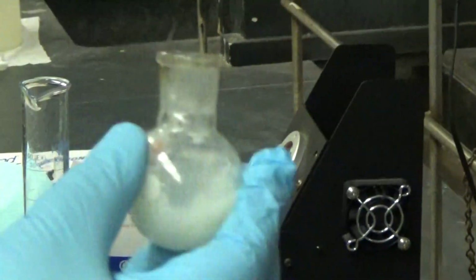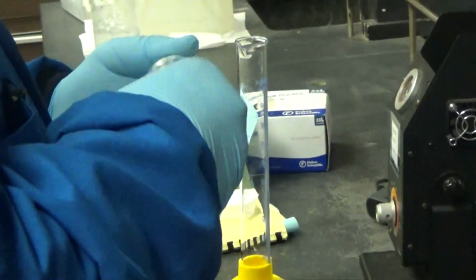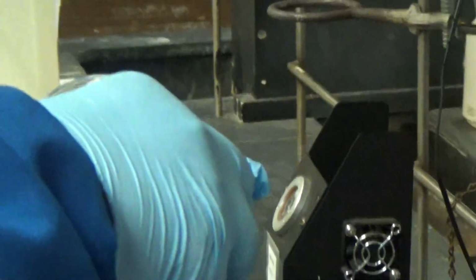So you just need to add some water here. You're going to add a little bit of water, and then shake it around and then dump it in again. So you washed out your flask a bit. Cool.